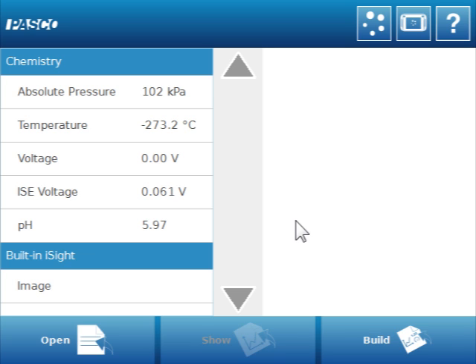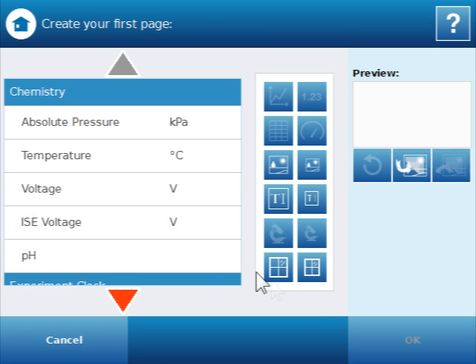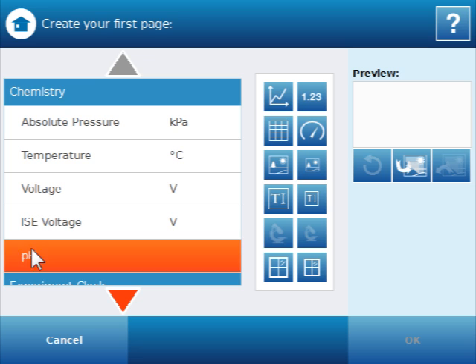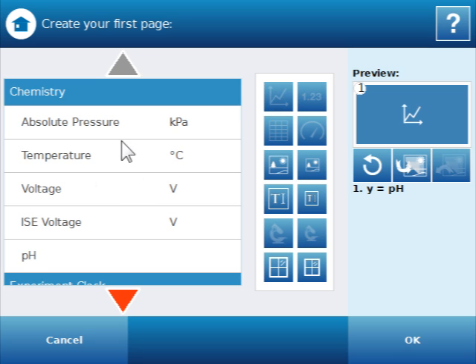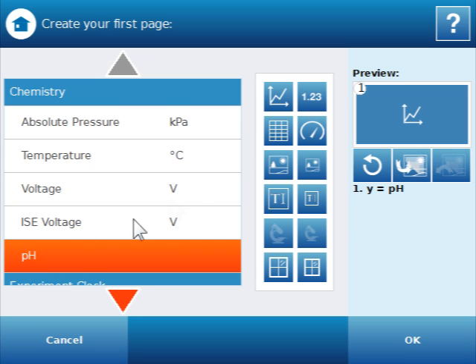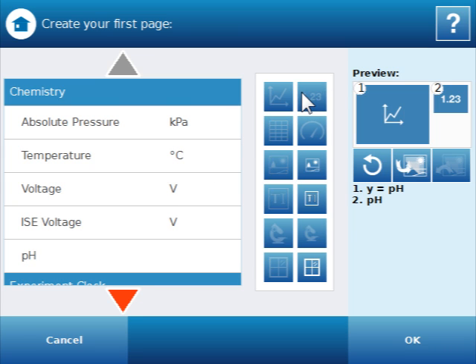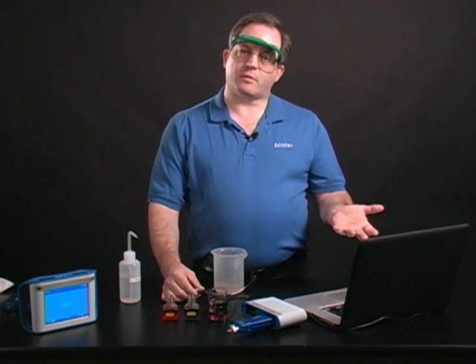I can use either of my paths. I could open a file or go to Show, but I'm going to use Build. I'll select pH and create a couple of displays that are commonly used with pH. Once I have those in place I'll say OK. Now I have a SparkLab created.